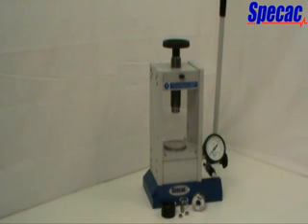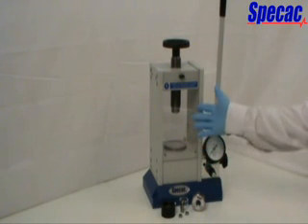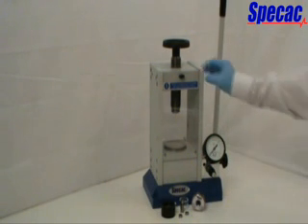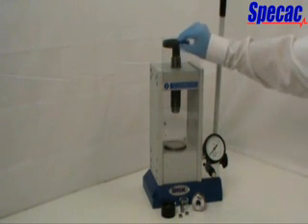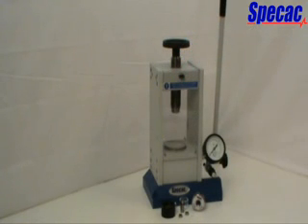The 15-ton manual hydraulic press works by pumping oil as a hydraulic fluid to raise a pressing piston and compress a sample held in the pressing area. The pressing area features front and rear safety guards which help for safe containment of any work being pressed within should an explosive event occur from the high forces that are being generated.